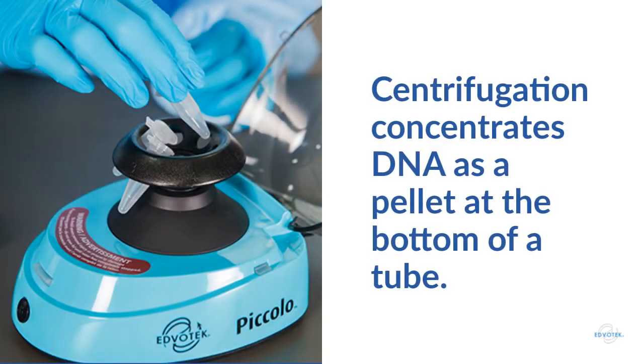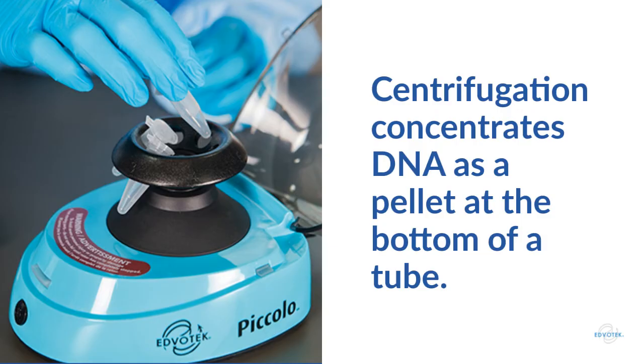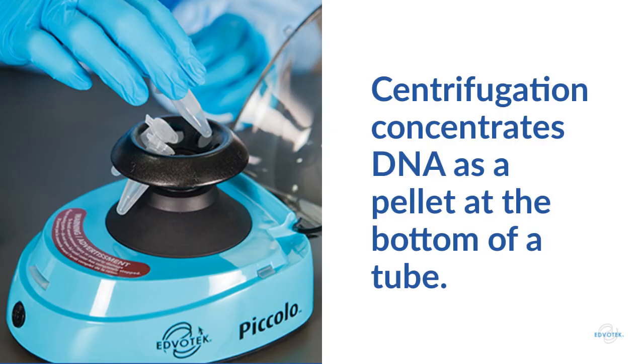The second and more common method is to mix and centrifuge the mixture at a very high speed, causing the purified DNA to form a pellet at the bottom of the tube. This pellet can be resuspended in buffer and used in molecular biology applications, including genetic engineering, transformation, restriction digest, PCR, and more.